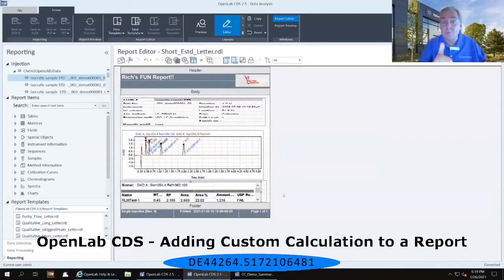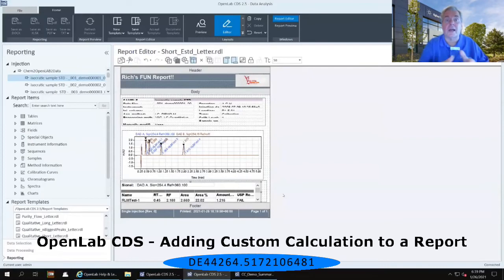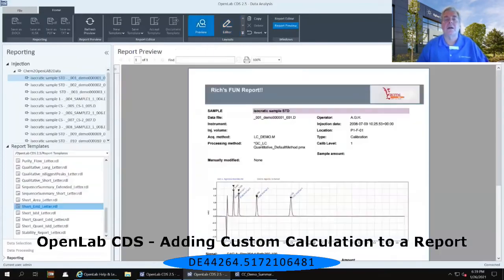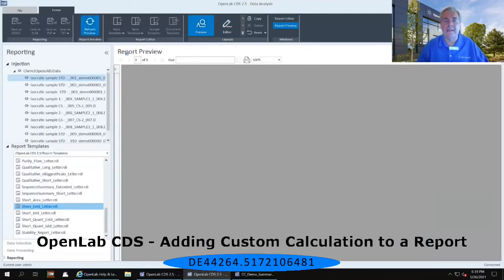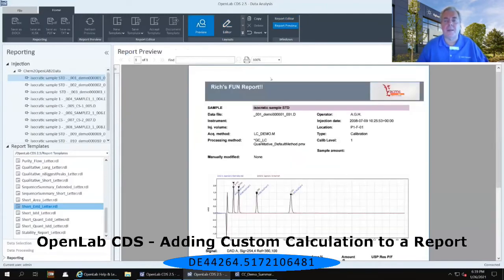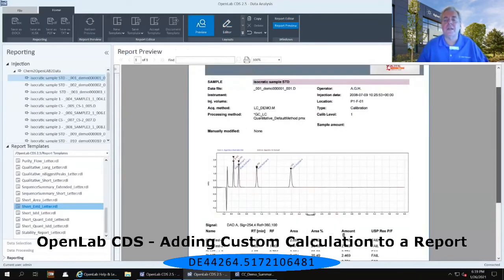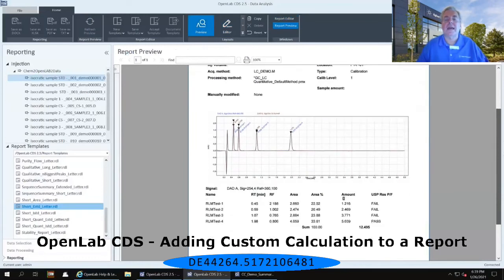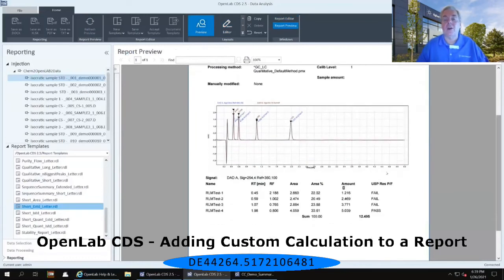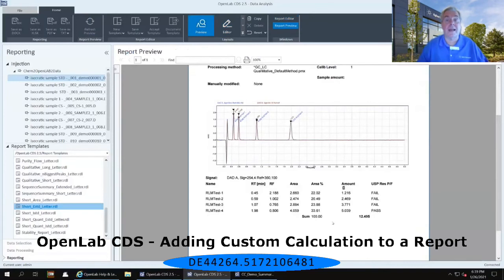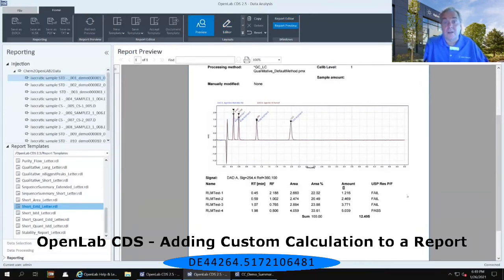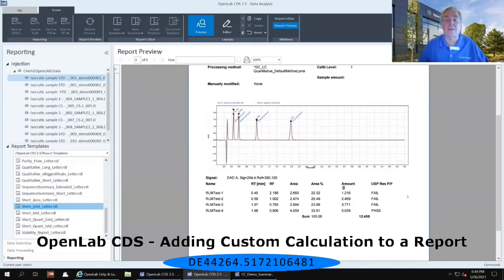But if I'd like to see what this specific injection looks like, I can select the preview in the upper layouts, and refresh preview again in that upper ribbon, and go down to the table, and notice that it has indeed added not only my area percent column that I added in the previous step, but my USP resolution, that custom calculation file, from my custom calculator, and gives me my pass fail criteria here as well.